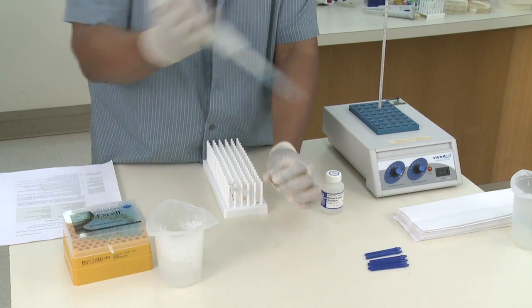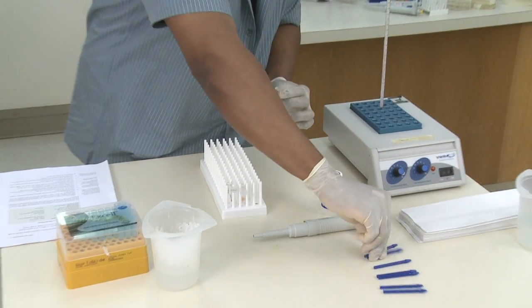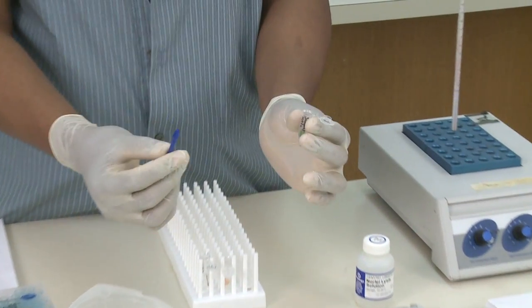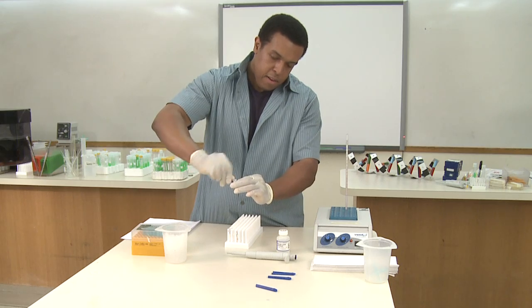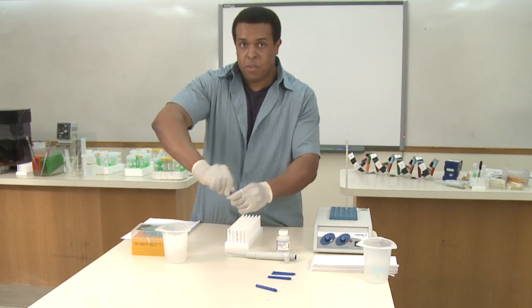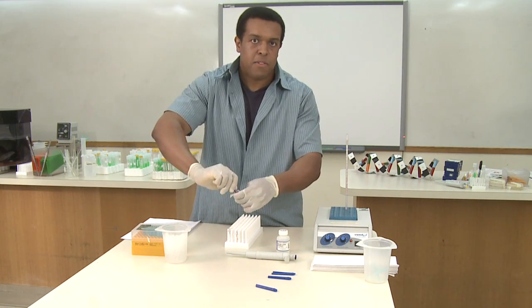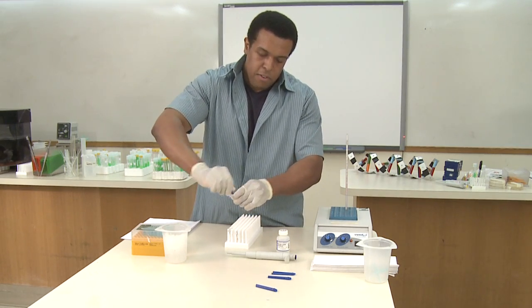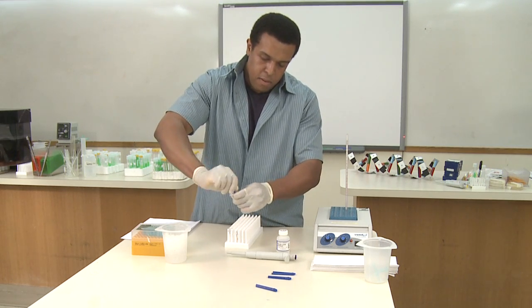Once you've added the solution to the sample, you can take a clean pestle and start grinding the sample forcefully for about one minute. Once you've ground the sample thoroughly, in some cases you may notice that the solution changes color — chlorophyll might be released with plants, with animals you may see some color change. Just grind it until you hopefully see some of that color come out. That means that you've done a good job.